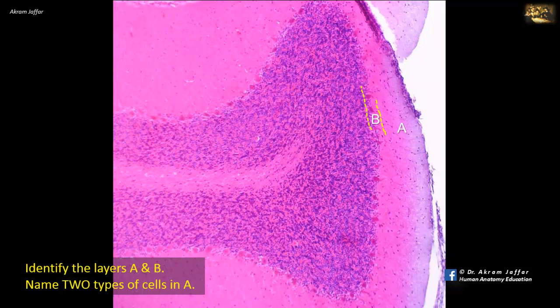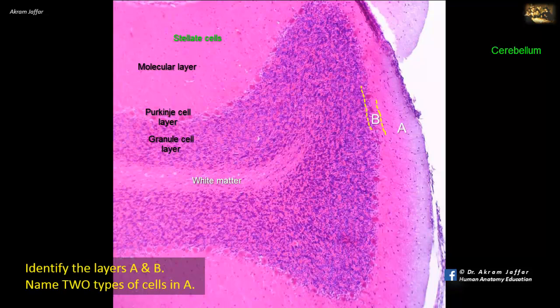Identify layers A and B, and name two types of cells in A. This is a histological section of the cerebellar cortex stained with hematoxylin and eosin. The cortex consists of three layers. A is the outermost layer, called the molecular layer. B is the Purkinje cell layer. The deepest layer is the granule cell layer. The molecular layer A consists of two types of cells: stellate cells located in the upper region, and basket cells located deeply, adjacent to the Purkinje cell layer.